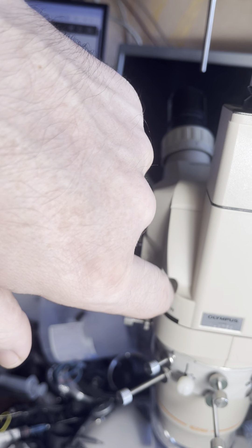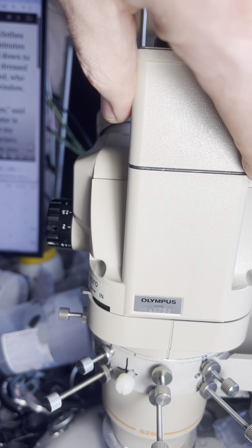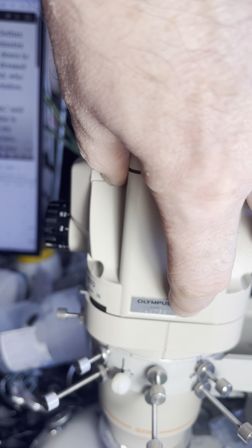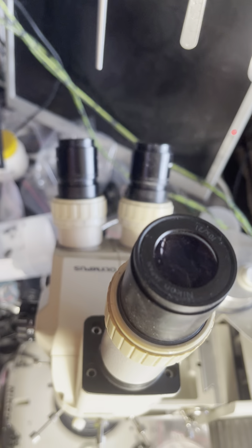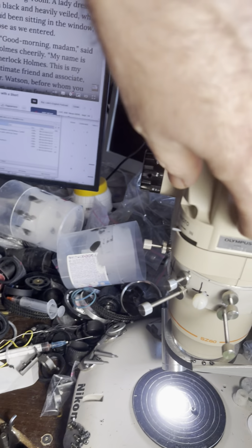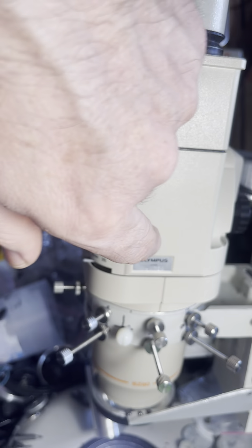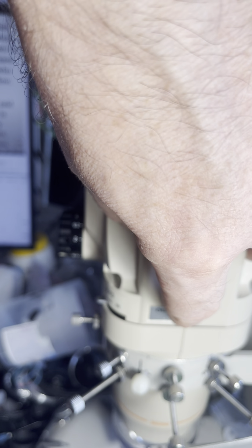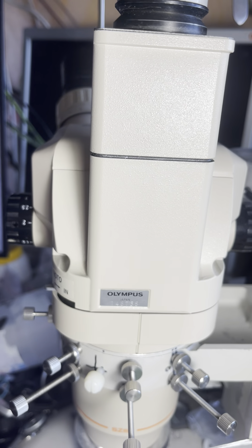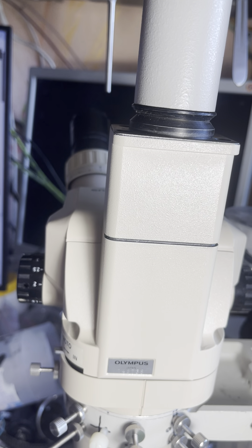This splitter also has some adjustment tuning: when screwing this part to the microscope, you can introduce slight tilts to get a more precise position for the eyepiece and the third exit. It's a very interesting setup for the SZ 40-60 models with a 50-50 prism splitter. Thank you.